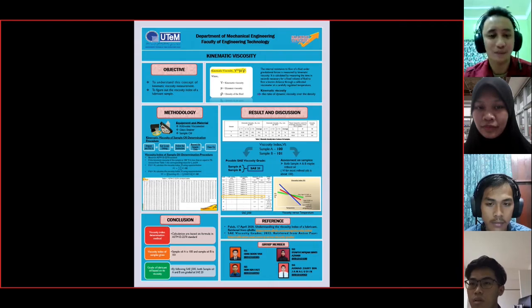When we key in and set the parameters, we select the mode one, use the speed and arrow key to input the oil density. After that, we select the mode 5 to press return and set the new oil density. We also select the temperature of 40 degrees Celsius and confirm it using the return key.